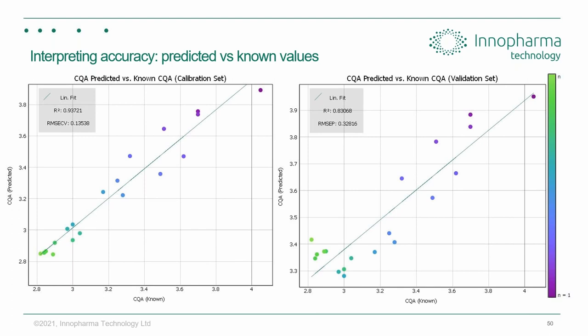They can be in the thousands. And in fact, that's a good justification. In the case of our Raman spectrometer, there are literally 1,024 separate signals. Principal component analysis tries to find what combinations of signals from all of those pixels change most closely with the change in concentration, in fact, changes most dramatically over the course of the experiment. And it presents you with quite a few principal components. But how many should be reduced to two or three?